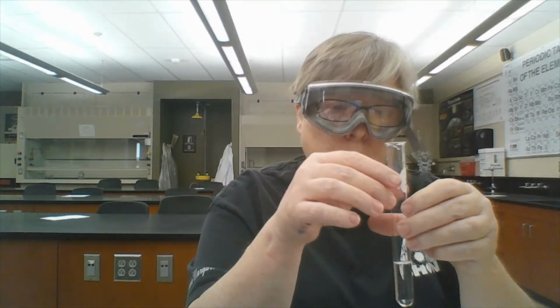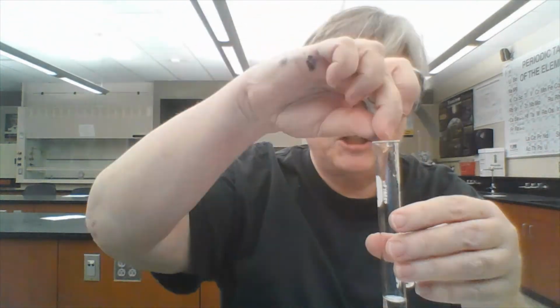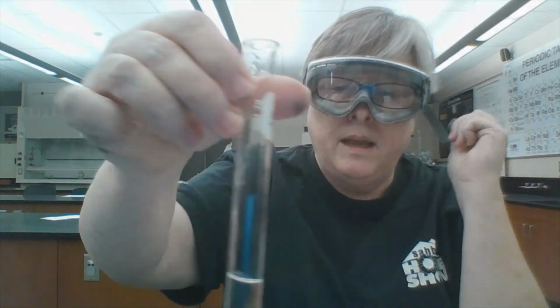Test tube number 1 is silver nitrate plus a copper strip. You can see my nice shiny copper strip. We're going to watch to see if anything happens. And this is test tube number 1 with silver nitrate and copper.